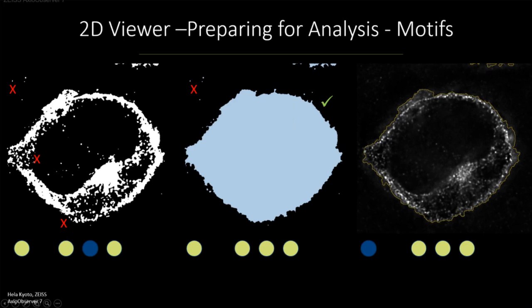So one thing I would do is take the image and first of all do an intensity threshold. So binarize it, so only the pixels above a certain value are going to exist and have a value, and all the pixels that are below the value completely become zero. And then what I would do is close these up. So I would basically do an operation that dilates these puncta, and where they join each other, they stay joined after an erosion.